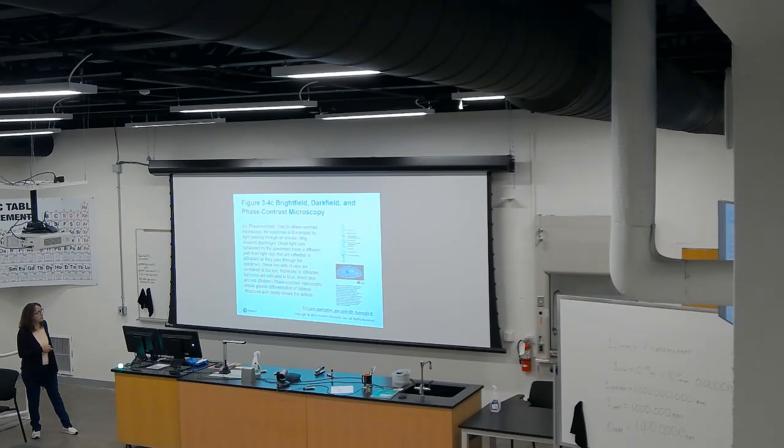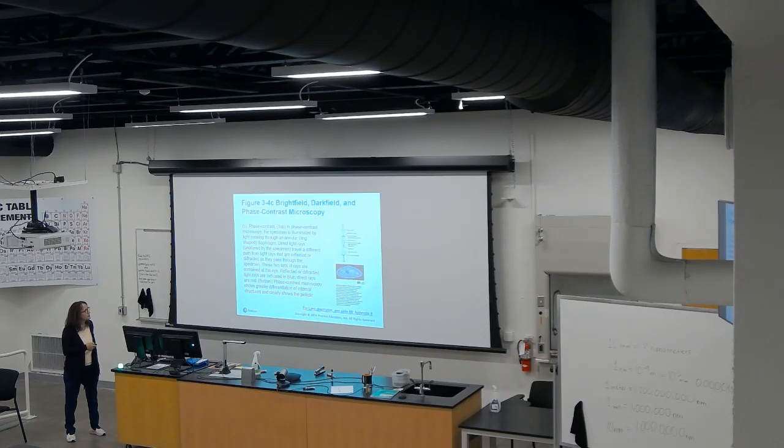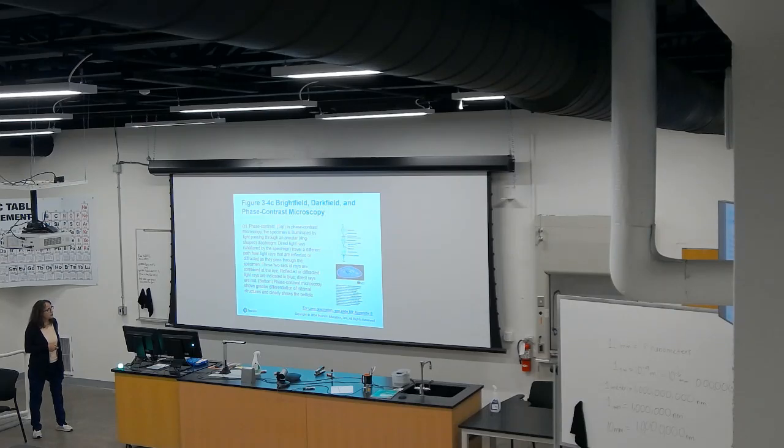And then you have refracted or bent, naturally bent light. Both of them will be picked up by this part of the microscope, and then it will be brought into the plane of the ocular lens, and you will see a dark object, a dark field, and an object within this dark field that shows better resolution than the previous one.